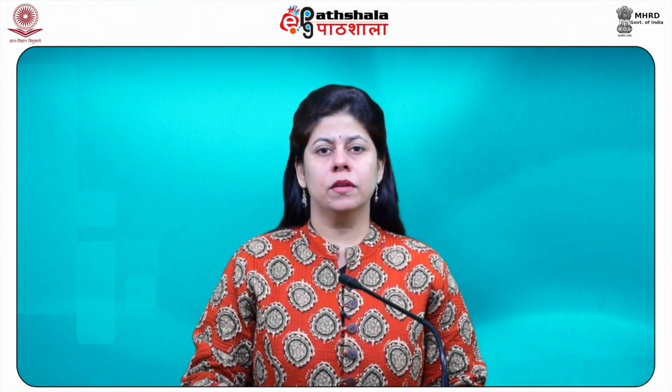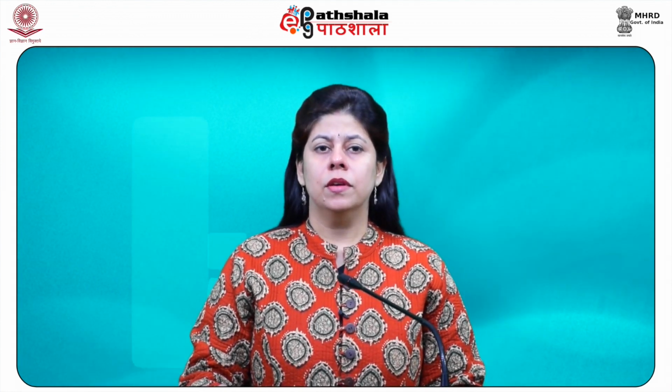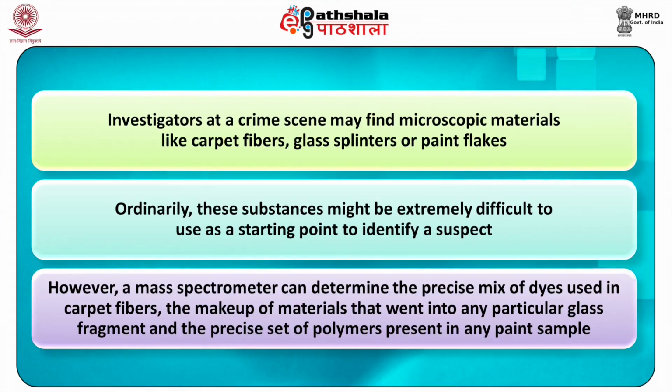Trace evidence. Mass spectrometry is also beneficial in examining trace evidence. Investigators at a crime scene may find microscopic materials like carpet fiber, glass splinters, or paint flakes. Ordinarily, these substances might be extremely difficult to use as a starting point to identify a suspect.